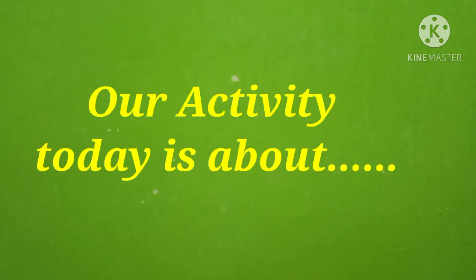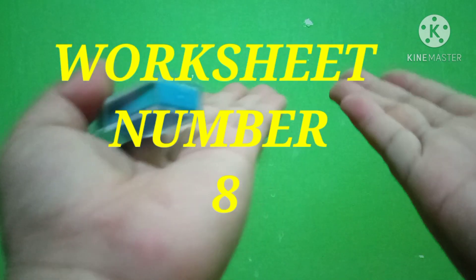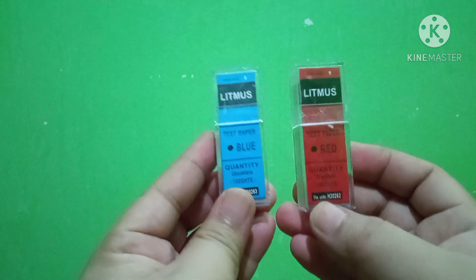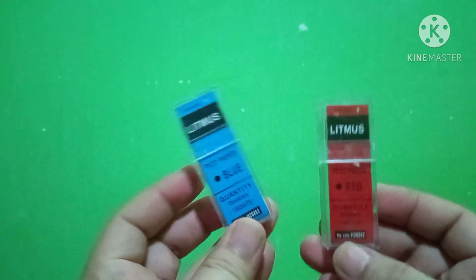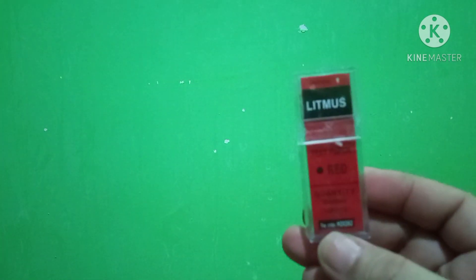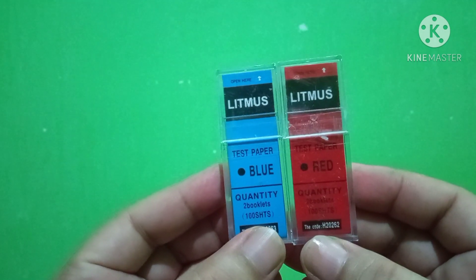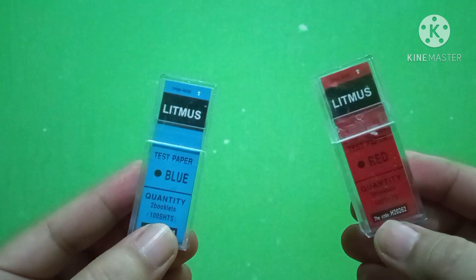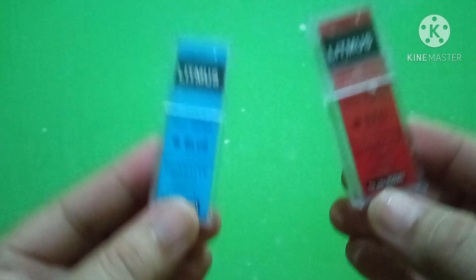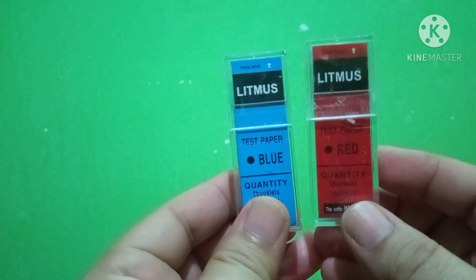Our activity today is all about acids and bases. This will serve as your worksheet number eight. We have two litmus papers: this one is a blue litmus paper, and this one is the red litmus paper. Take note of how litmus paper looks — we will use it to test the acidity and basicity of a solution.